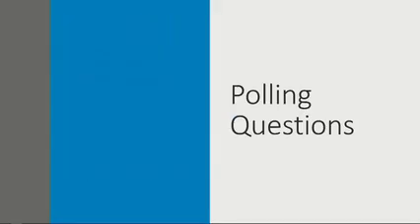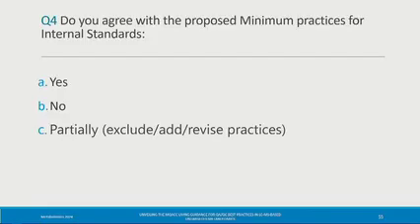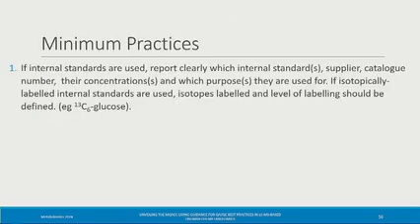So now let's go back to polling questions. If you guys can open your polling up. And I will ask you as the first question, do you agree with what we are proposing as a minimum practice for internal standards? So the answers are again the same as before: yes, no, or partially. And I'll refresh your memory. For minimum practices, we only had this one: tell us which internal standards and at which concentration, or for which purpose, you are using them.